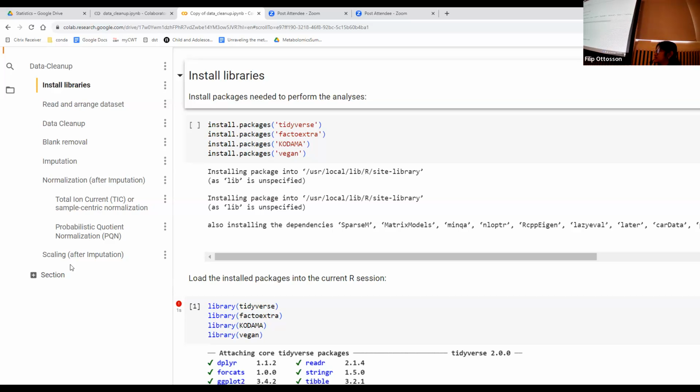It's based on the intensity. We just compare if a particular feature's intensity is, for example, 10, and it's also 10 in the blank, then probably it's from the blank. So you might remove that feature. This is where the threshold plays a role. You just set the threshold. So you're not entirely removing all the features that are present in the blank.